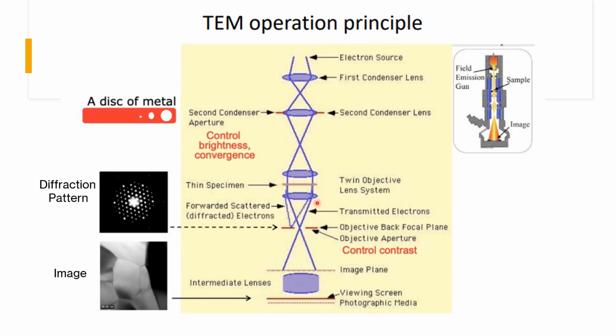This actually forms a diffraction image over here that we are seeing, that this is the diffracted electron at the objective back focal plane. And instead of convergence over here, we can also project it further by using a projector lens on the fluorescent screen, right, to have an image of the same complex.